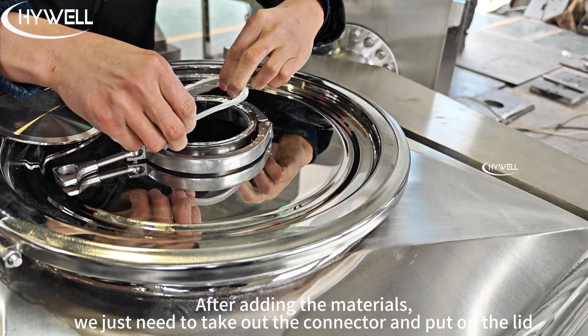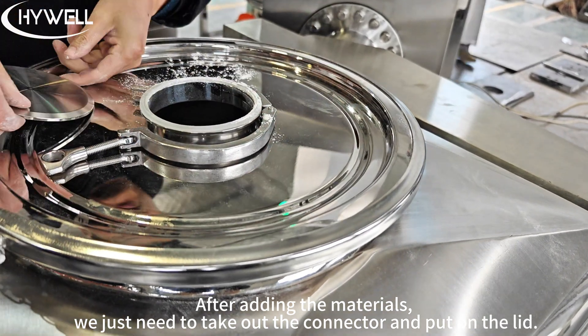After adding the materials, we just need to take out the connector and put on the lid. Let's take a look.